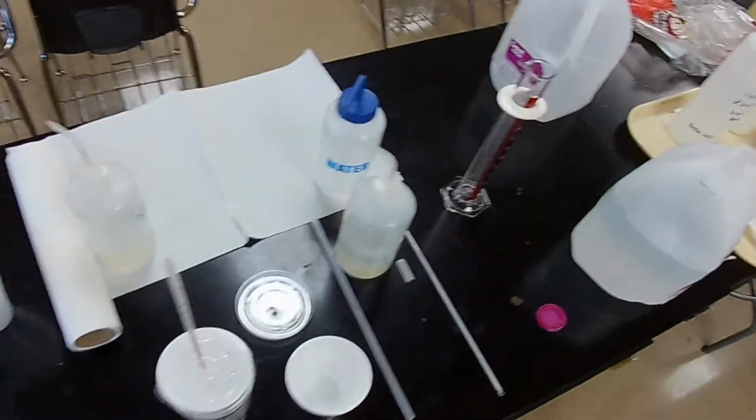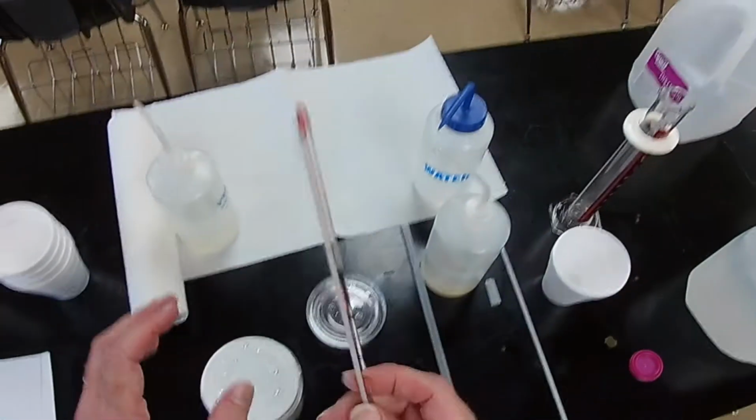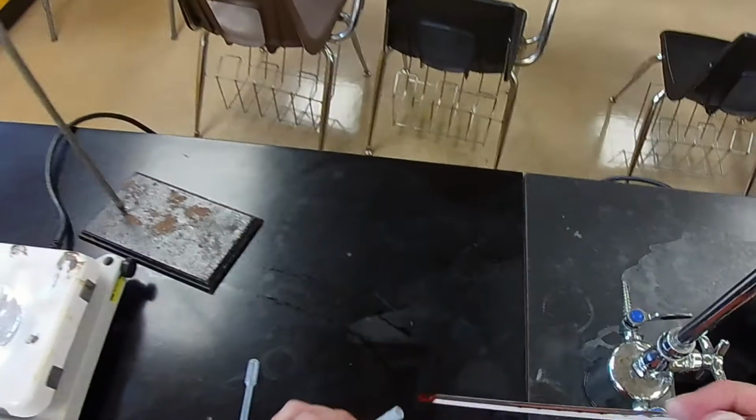Now that we have that data, we can actually do the experiments using this calorimeter. So what do we do next? We be sure that we keep this thermometer with the calorimeter, and this one is separate.